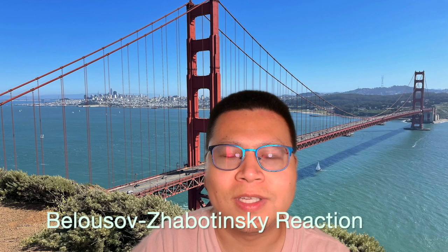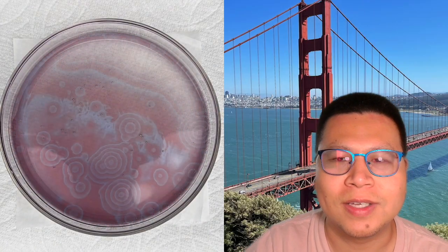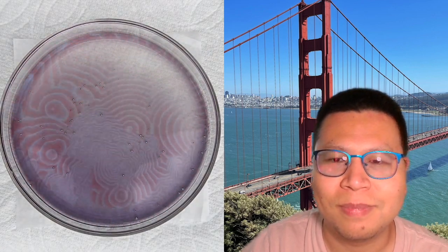This is the 5th episode of the BZ reaction video series, also known as the Belousov-Zhabotinsky reaction. This is one of the most intriguing, most visually striking, and most lifelike reactions where we can observe self-organized wave patterns or rhythmic patterns in a spontaneous chemical system.